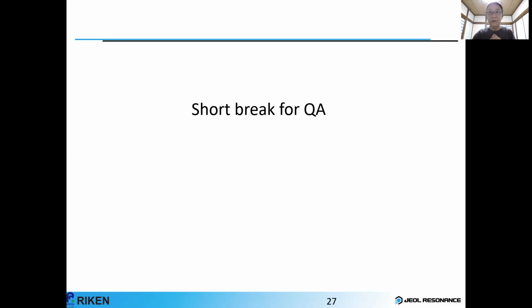So in this case, we have to be careful. In addition, we also suffer from heating by the eddy current. For example, if we put solder on the sample rotor, we can easily melt it. The sample temperature can easily rise higher than 200 degrees Celsius. So we have to be careful about that.